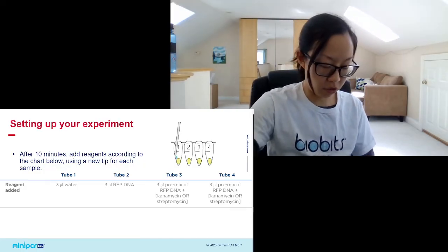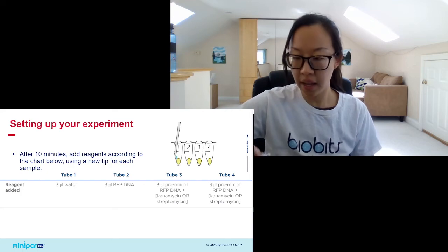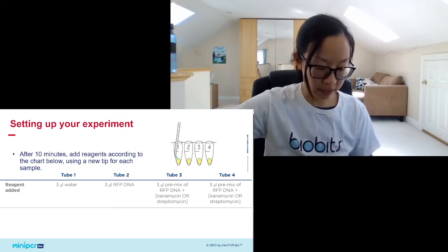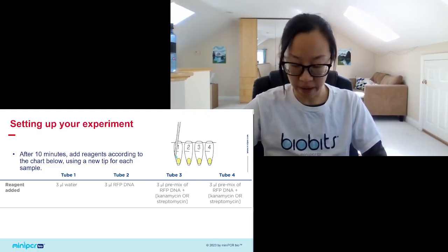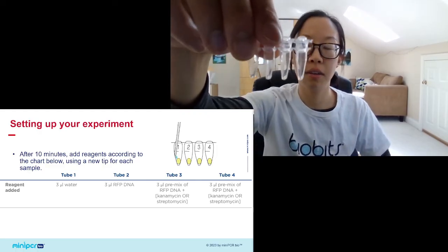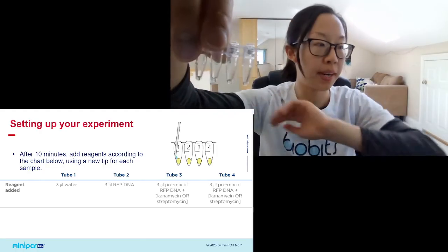All right, tubes are going everywhere on my desk. That's okay. And I'm just gonna shake things down. So now I have 6 microliters total in all of my tubes. You can see here. Yep, right there.